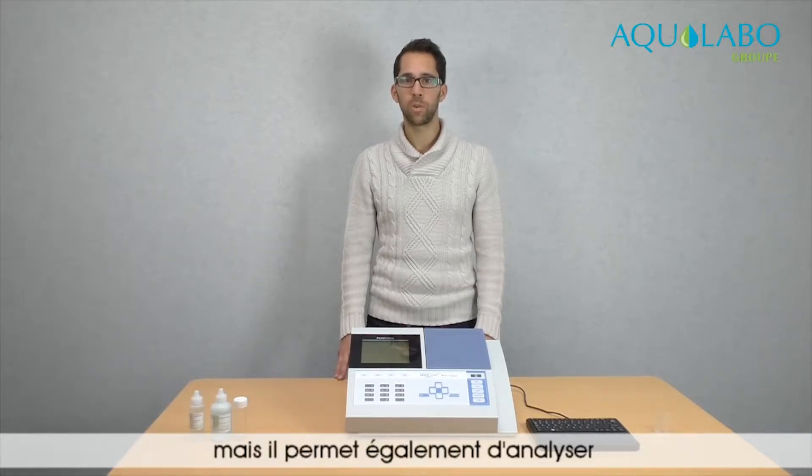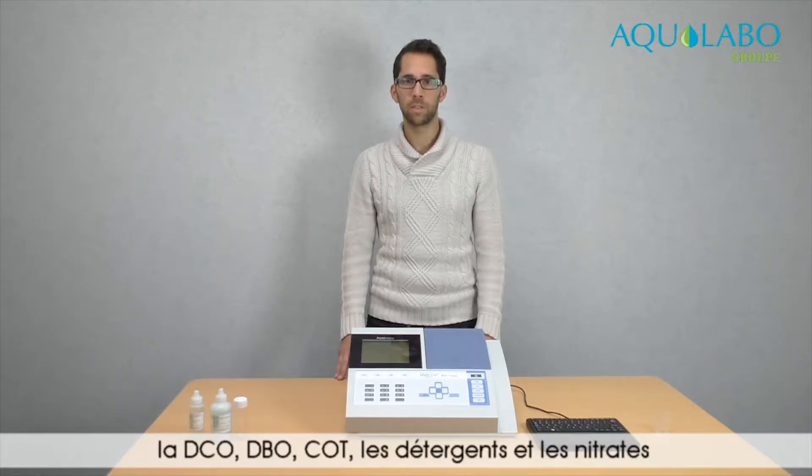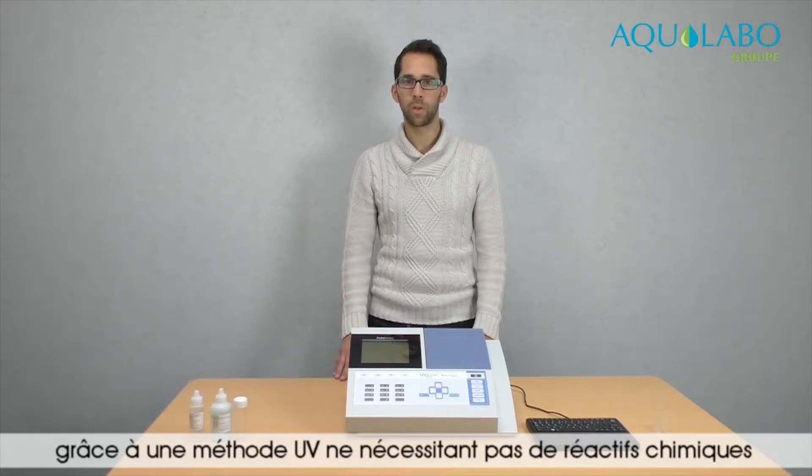It is also able to measure parameters such as COD, BOD, TOC, detergents, and nitrates, thanks to a UV method that doesn't require chemicals.